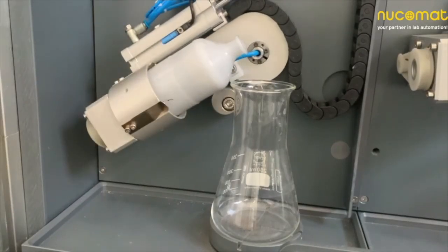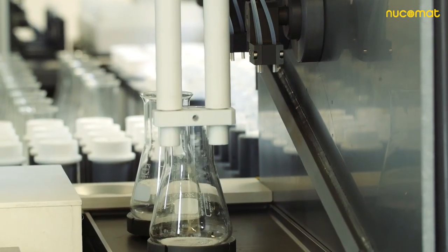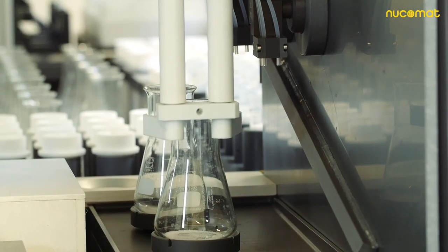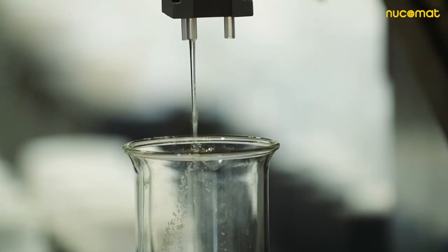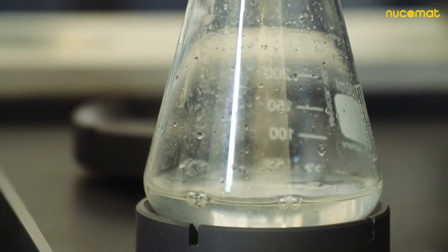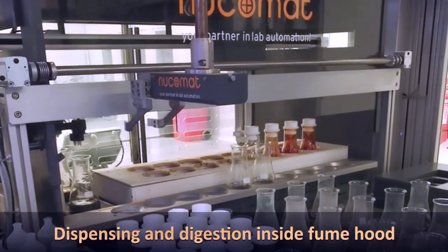Each incoming powdered sample is gravimetrically dosed with milligram precision. An automated acid dispenser, operating on an analytical balance, then adds exactly measured amounts of concentrated acids inside a dedicated fume hood. A corrosion-resistant robot carefully transfers the sample to a hot plate for digestion.